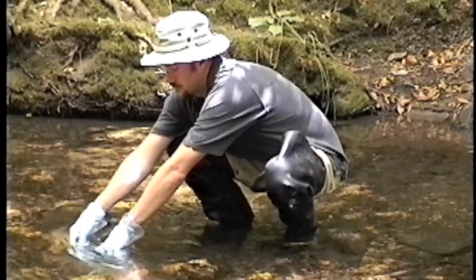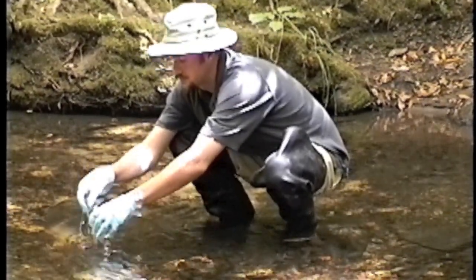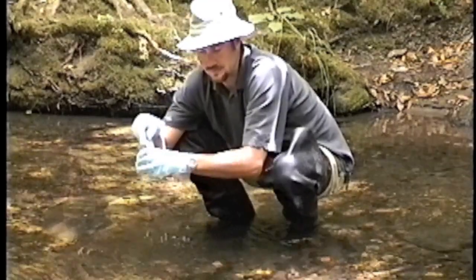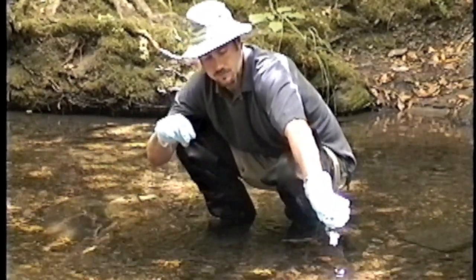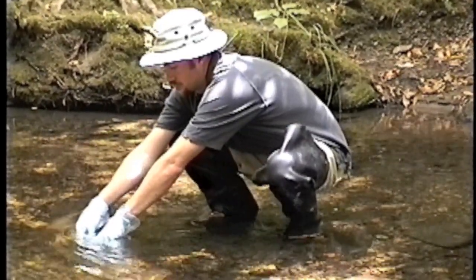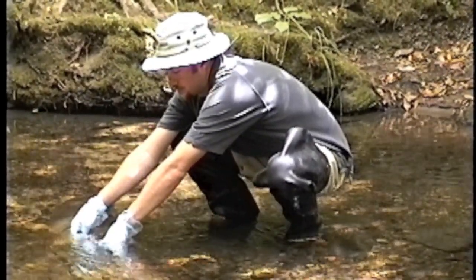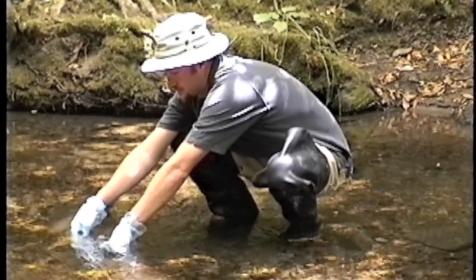Note that he is opening the bottle and closing the bottle under water so that the bottle has no contact with the surface of the flow. You keep that process three times. After rinsing three times, he is now going to fill out the bottle all the way.